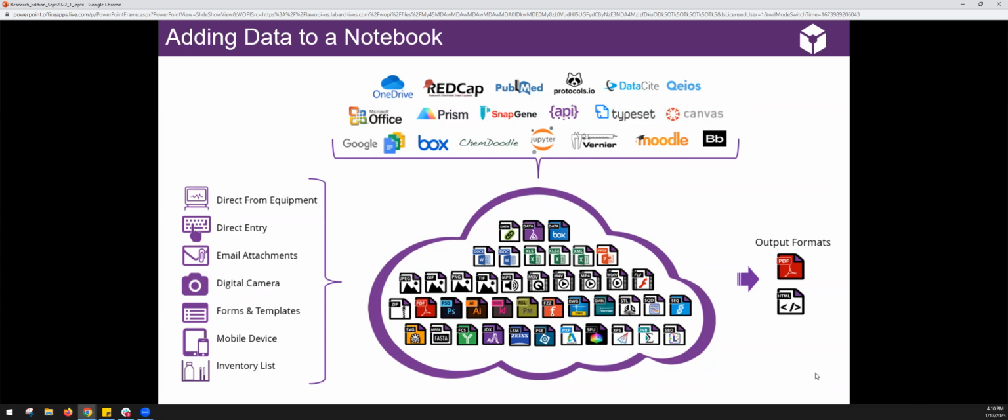We're not going to manipulate or change your data in any way. It is still your files. It is still your research. It is Weill Cornell research. We're not going to make changes to that. You can get it back out. You can work with it as you need, when you need.